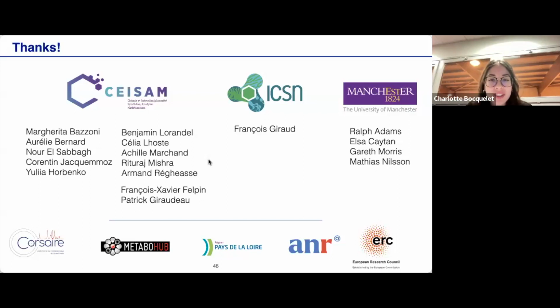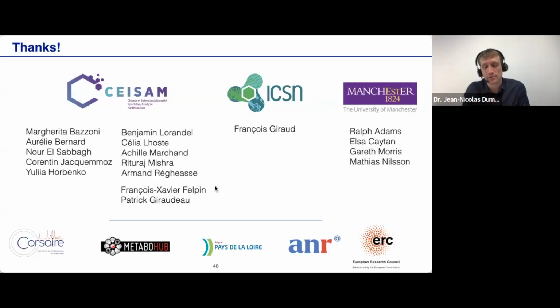Okay. Next question is, first, thanks for the great talk. When using X gradients, do you put the CTP gradients on X, Y, or Z? Do gradients on different axes interact with each other? So thanks. That's a really good question.